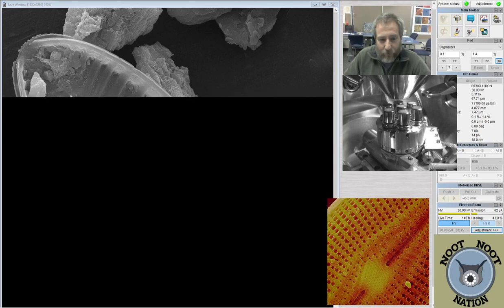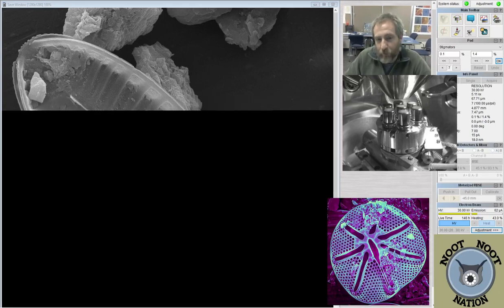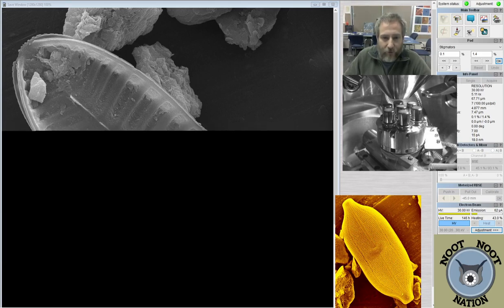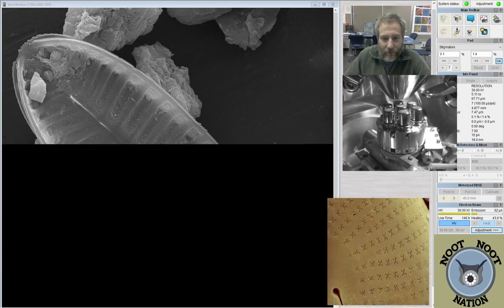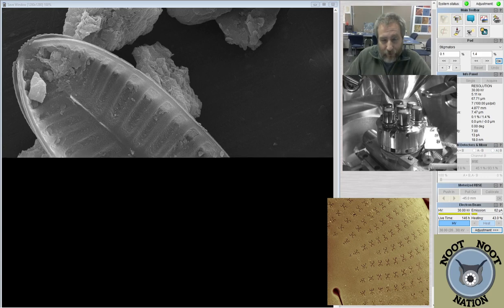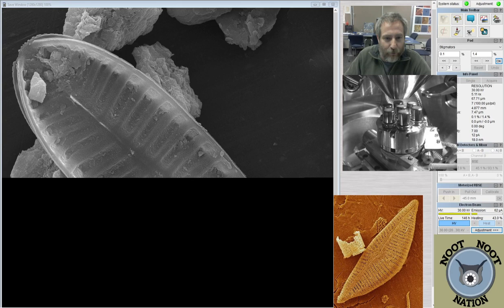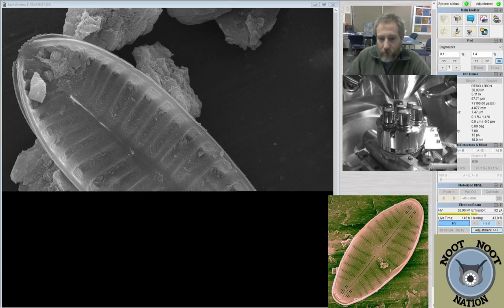We are looking at some diatoms from the Wabash River. And I'm collecting images for a student poster that my lab technician Mallory is on, and another student in my lab, Mary, are both on the poster. So they left a little space on the poster, or they're planning to, so that I can give them diatom images. And that's what I'm doing, collecting them. They've got to actually submit the finished poster today. So we're right up against the deadline, but I told them I could get them to before 3 or by 3, then they can just integrate them onto the poster. So that's nice. And it shouldn't take me long.